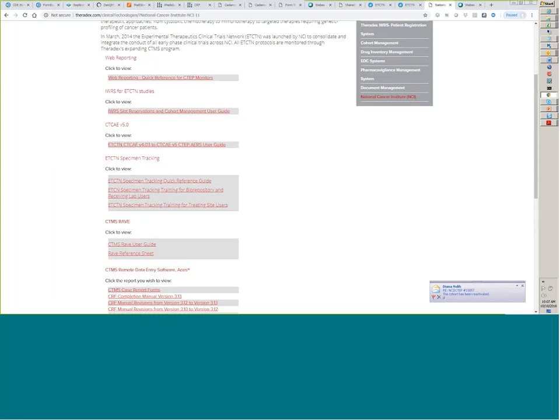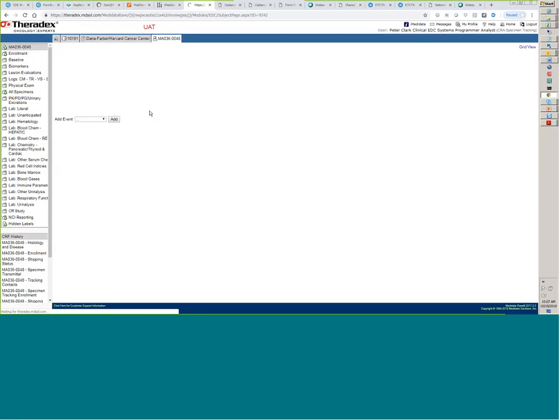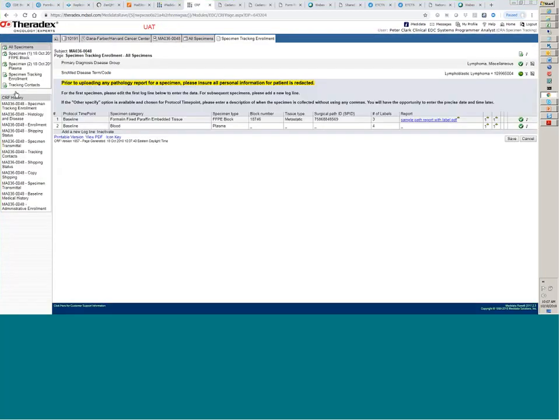Hi, this is Sarah. I just have a really quick question. About the FedEx tracking information, sorry if I missed this, but is that coming from the site using their own FedEx systems, or are those sent out in the kits? That's a very good question, and I'm not 100% sure about it. I know that sometimes the biorepository does include that FedEx information with a kit, but I don't know for sure if that has been organized for your protocol.